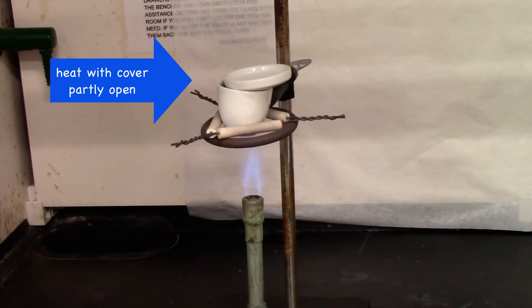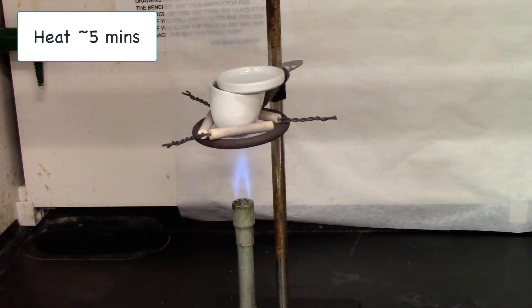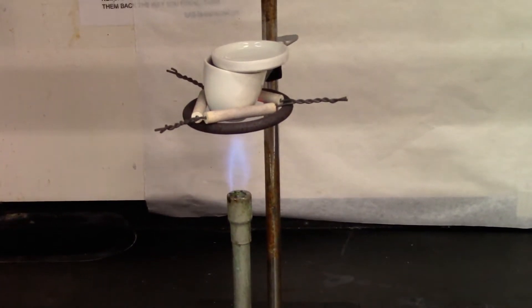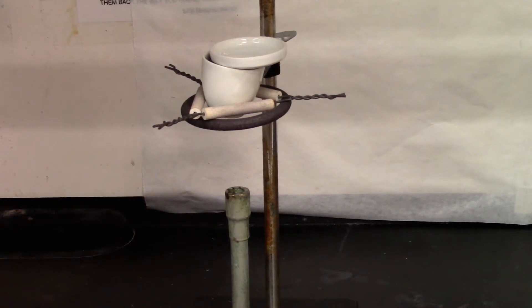I will let the empty crucible heat for about five minutes and then cool it down and get the empty mass of the crucible with the lid. We'll turn off the gas and let the crucible cool down before we can weigh it out.